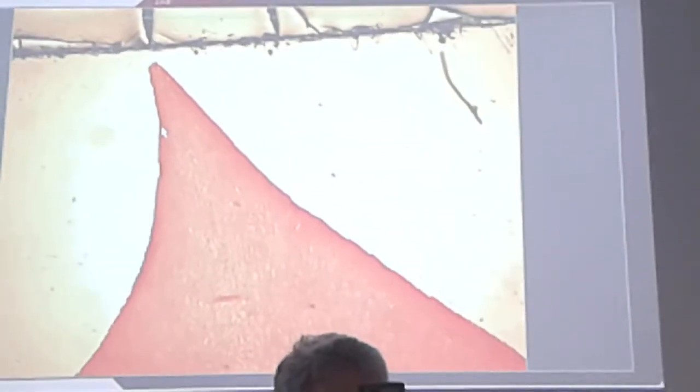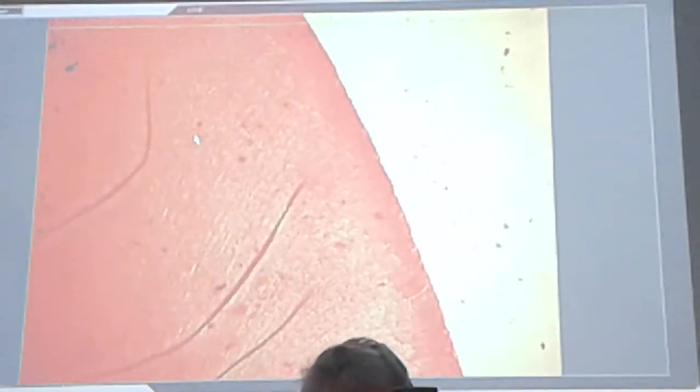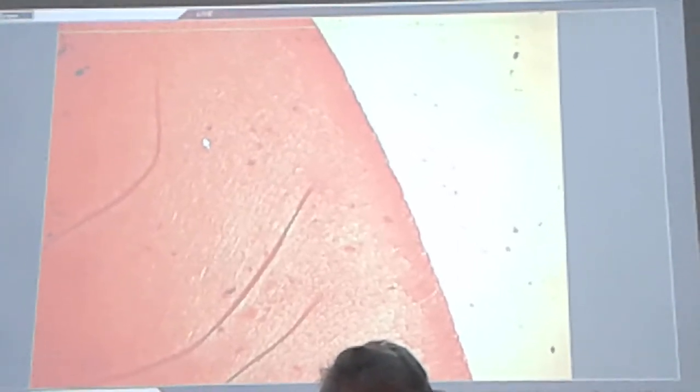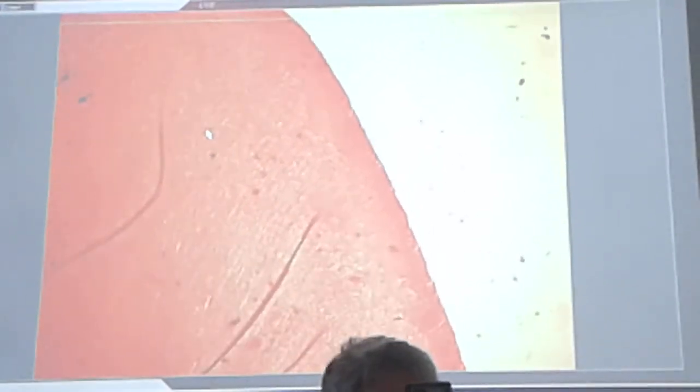As you see, we can observe the crown part of the tooth, and going through this crown we can go through the neck portion. Here this is an individual tooth, not resting in the bony alveolar material, not in the mandible or maxilla, so maybe it is difficult to recognize the neck portion.